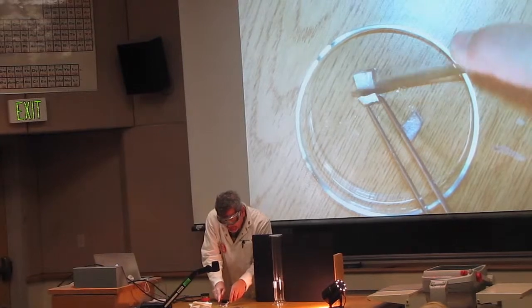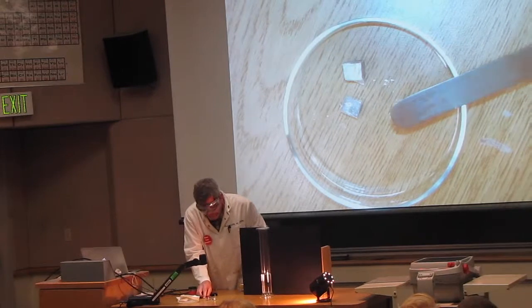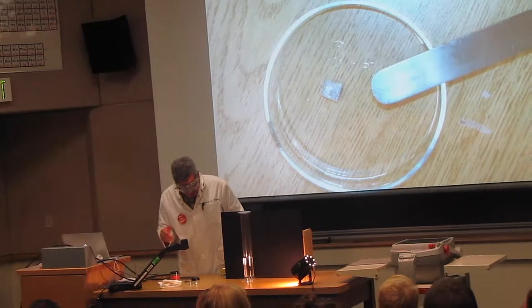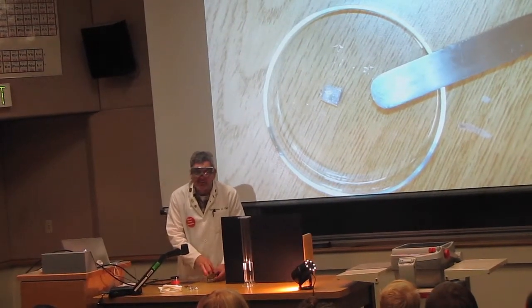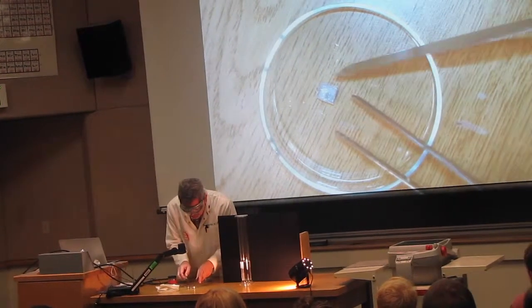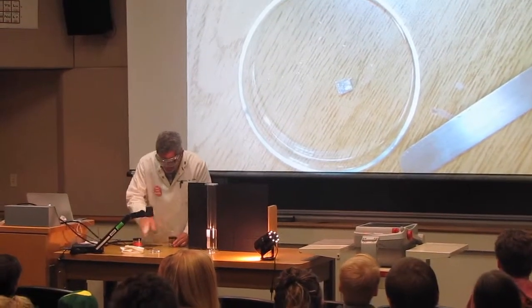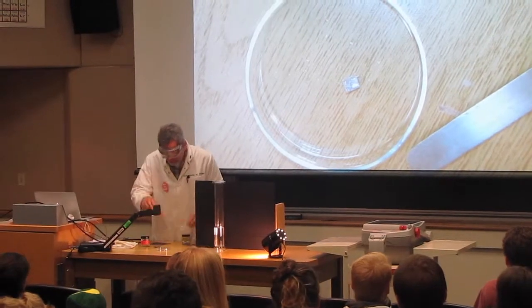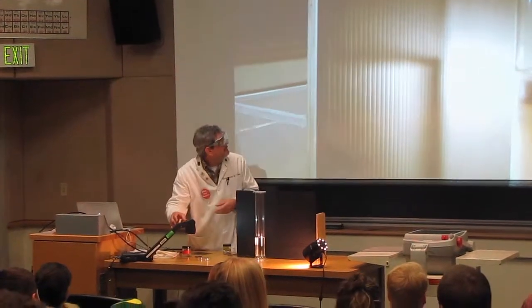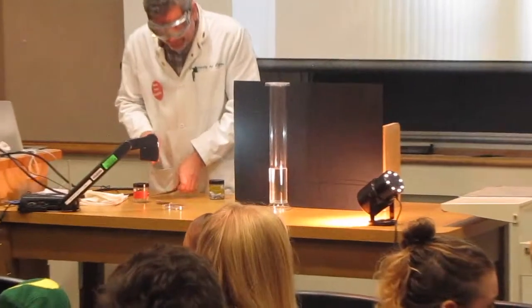So in terms of hardness or softness, we notice that they have that same physical property. They're both fairly soft, particularly for metals. But we see a trend. So would you say cheddar is harder or softer than Parmesan? Softer. Okay. Then we'll take this and put it in our water and see what happens.